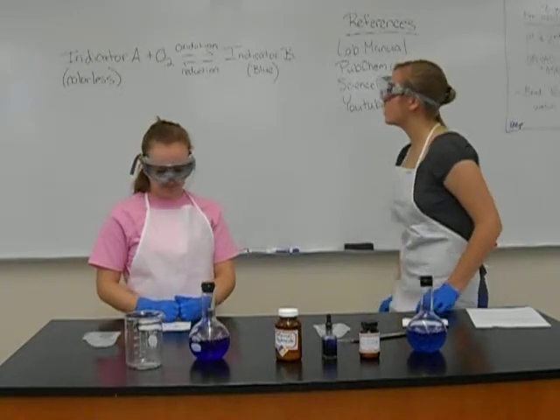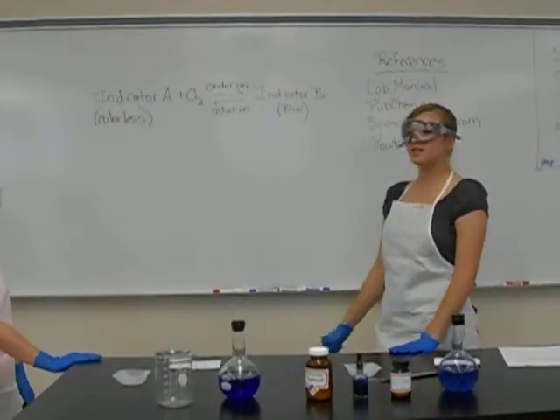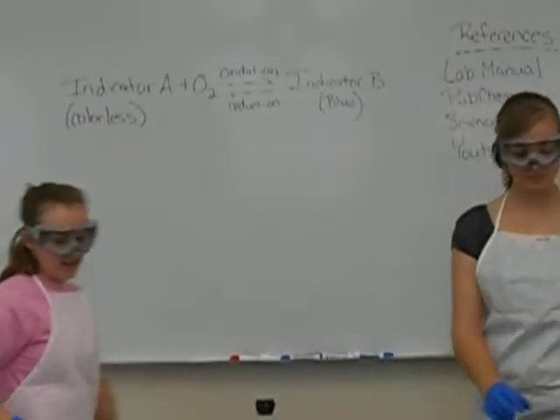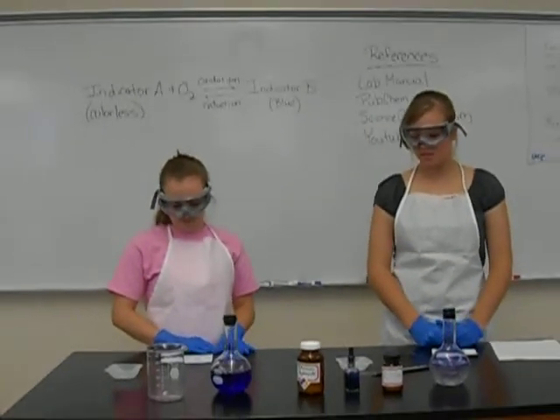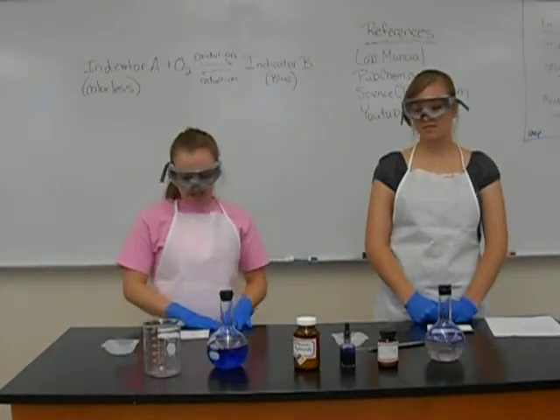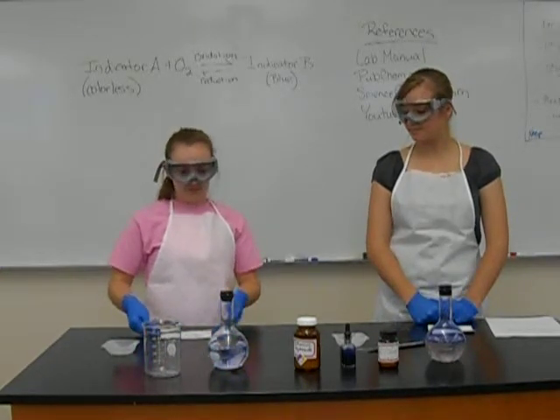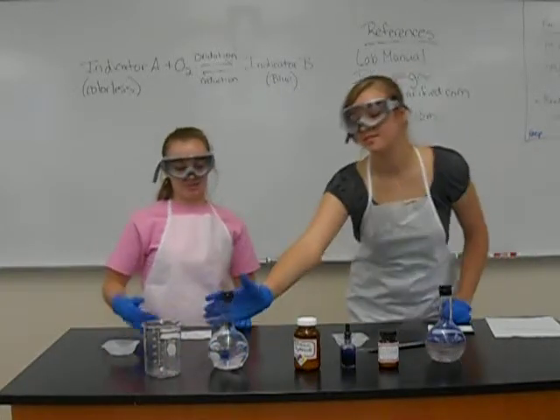To explain this a little better, as indicator A is added to the O2, it undergoes oxidation to the indicator B, which is the blue form. Then it goes back to reduction, making it colorless. And reduction is the loss of oxygen, so the electrons are gained back into the methylene blue. And this side-by-side oxidation-reduction reaction is called a redox reaction. So our first solution just turned clear, so if we shake it again, it'll turn blue.